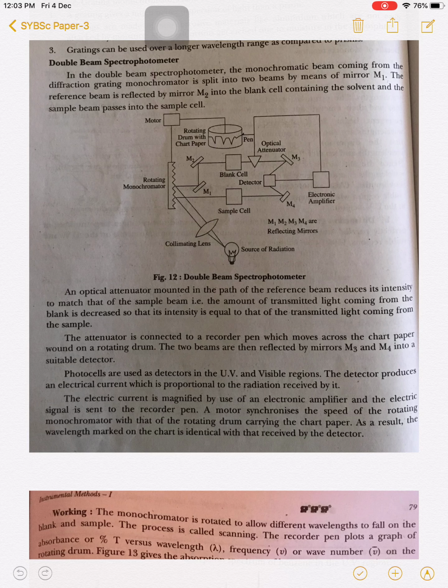A motor synchronizes the speed of the rotating monochromator with that of the rotating drum carrying the chart paper. As a result, the wavelength marked on the chart is identical with that received by the detector.